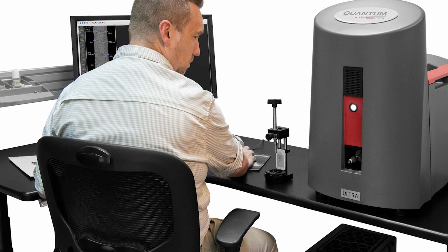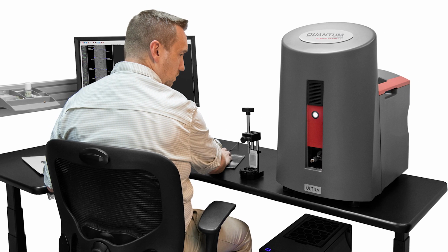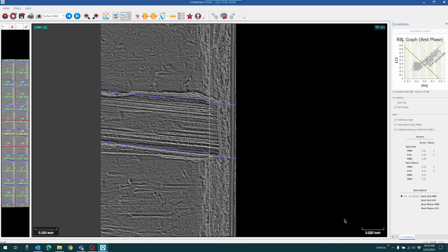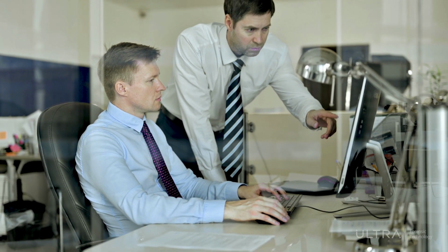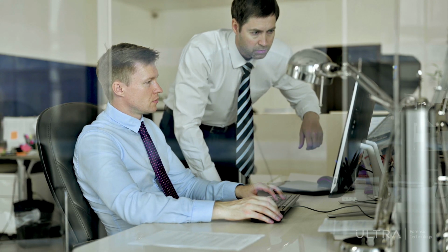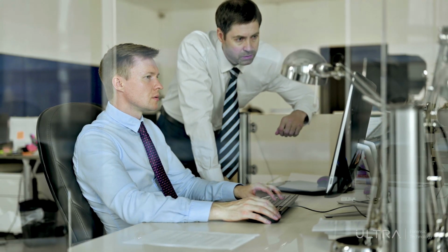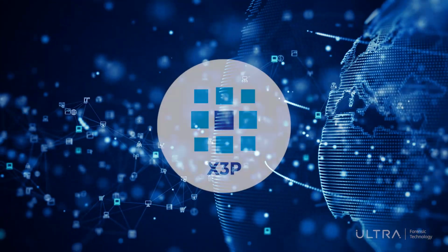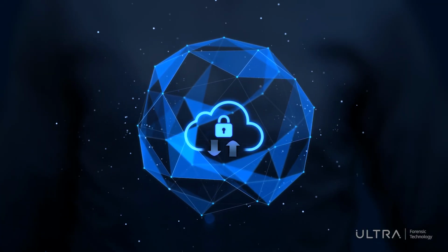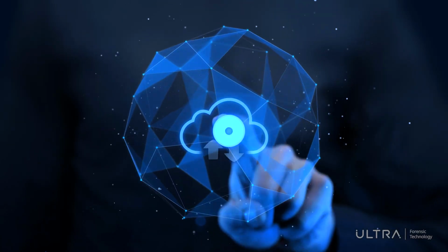Overall, using Quantum can be much faster than working with a conventional light microscope, especially for more complex casework. The Quantum 3D microscope is also useful for research and studies, as well as for training and proficiency testing. New methodologies and best practices can be imagined as it becomes easy to share sets of 3D acquisitions with others.